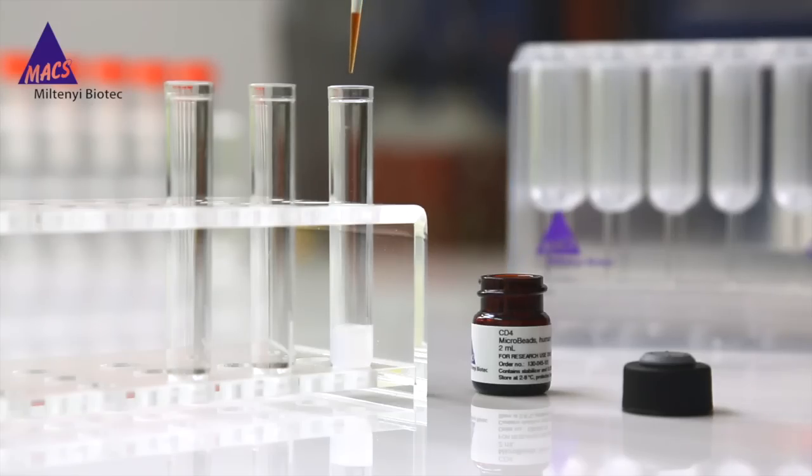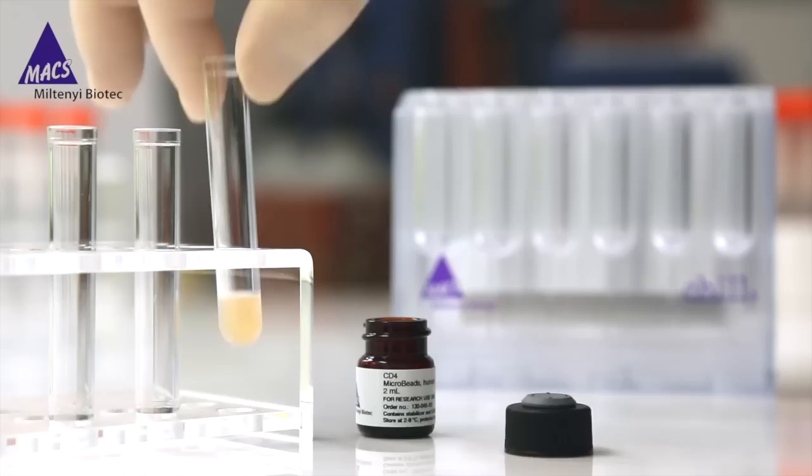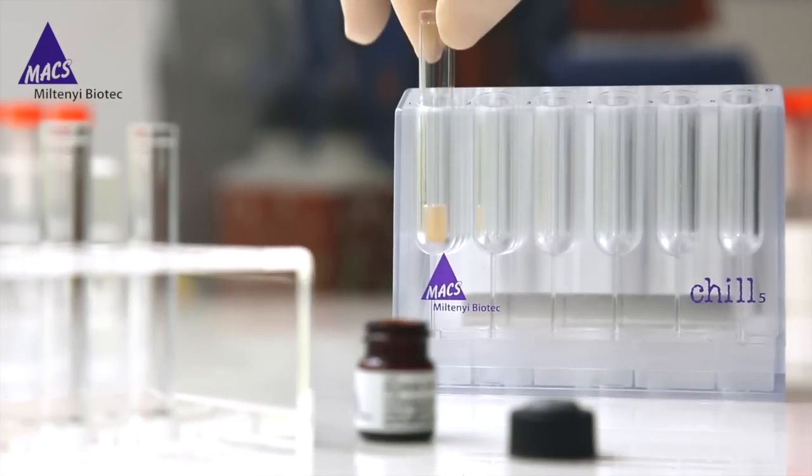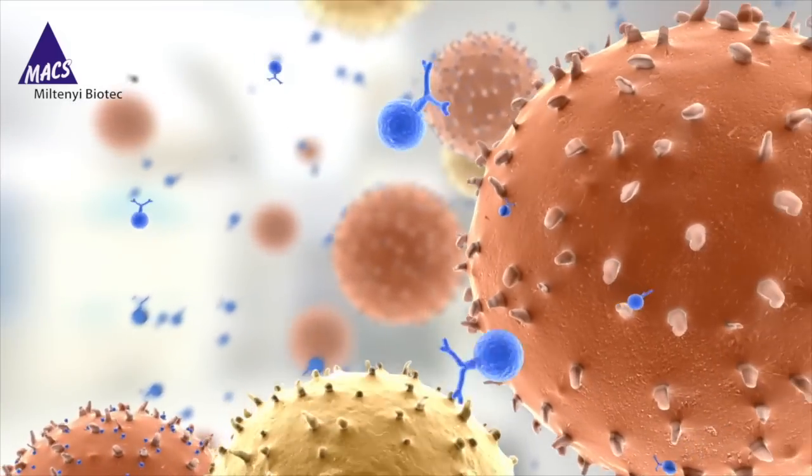Let me show you how it works. First, you magnetically label the cells with Max Microbeads for a few minutes at 4 degrees Celsius. The nano-sized microbeads are non-toxic, biocompatible, and do not affect the functionality of the cells.